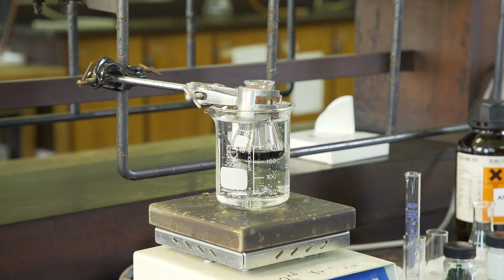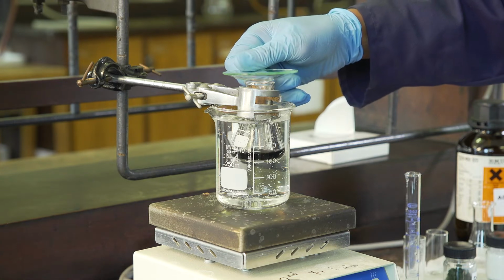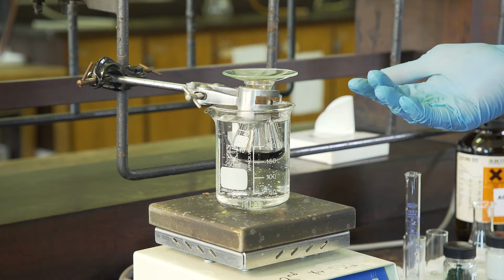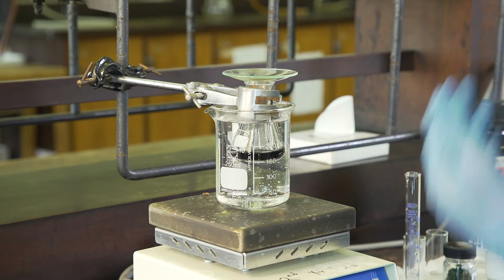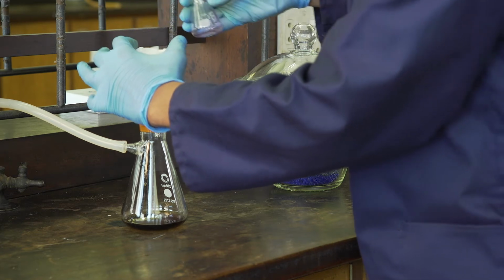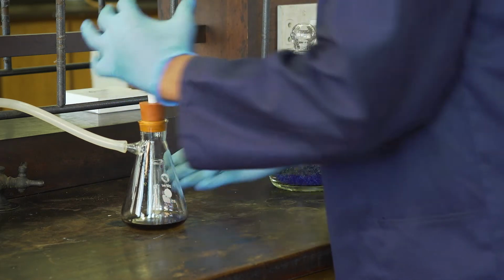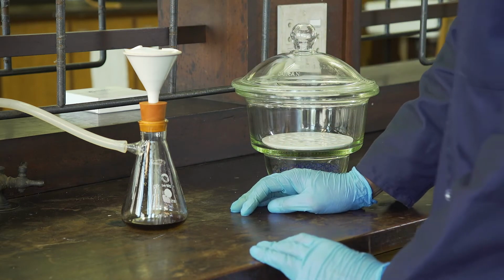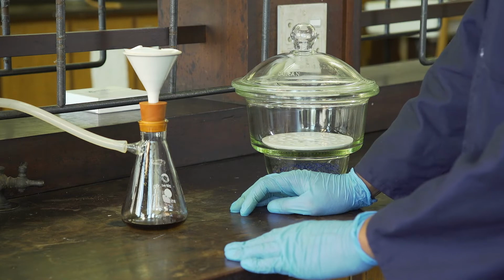evaporate. Once you have lowered your 25 ml conical flask inside the hot water, cover it with a watch glass to prevent gaseous compounds from escaping. And you then leave it for an hour and observe as your crystals begin to form. Once filtering has commenced, you will then wash them with ice-cold water to remove all impurities.